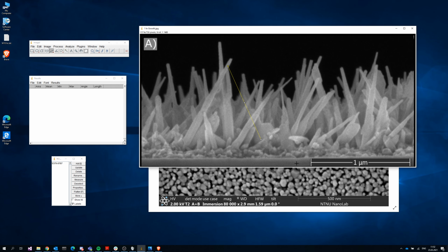Say you did that and you added it, you have to individually come back and clear it out here. Okay, so once again, let's set the scale. The scale bar is quite different this time.